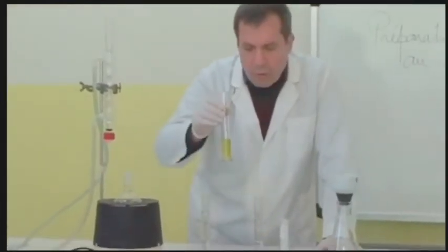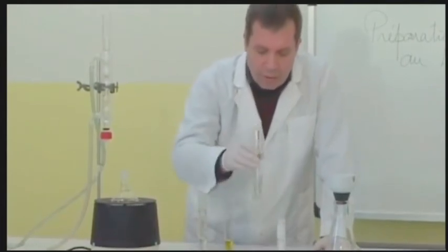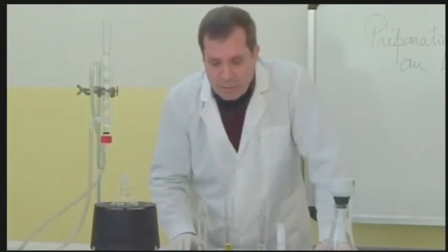20 milliliters of olive oil, and 20 milliliters of ethanol. The role of the ethanol in this mixture is to ensure a good contact between the reactants of this reaction.